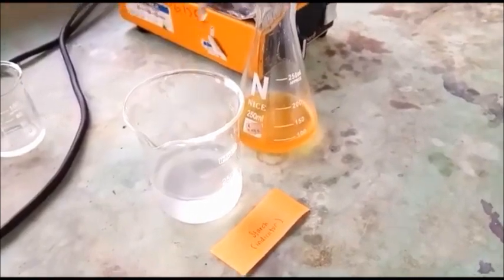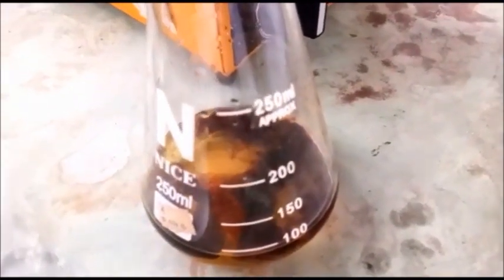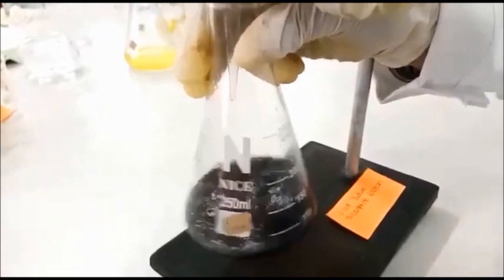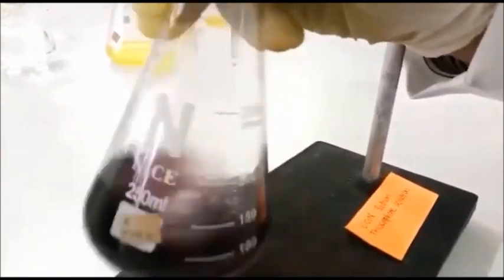Lastly, add 0.5 ml of starch. The solution will turn to dark blue. Followed by the titration of sodium thiosulfate solution. In this titration, the mixture is to be shaken vigorously.